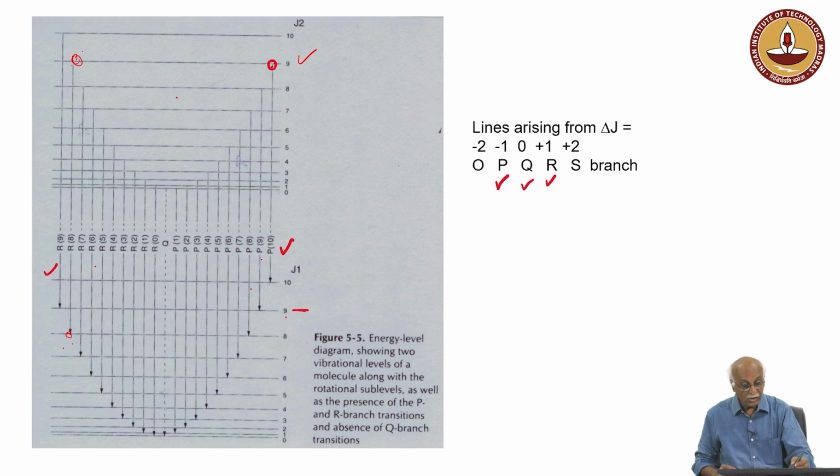There can be absorption, similarly there can be absorption in a similar way. So, short wavelength absorption is represented by R, and long wavelength absorption is represented by P within those bands. And where there is no change in the position, from 0 again coming back to 0 here, it is represented by Q.